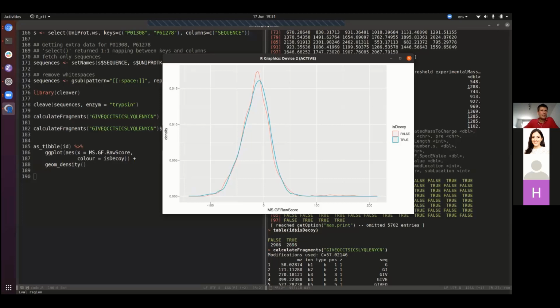So I didn't join this early, but I have a follow-up question from what Karen asked. I'm trying to do some work treating some cells with a certain drug, and then to look at the proteome of the parasite after treatment. And I'm supposed to go in blindly, so I do not know if I'm going to get any novel proteins or not. So how am I able to identify, after, say, trypsin digestion, the individual fragments and how to put them together?